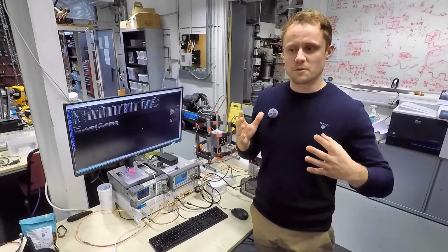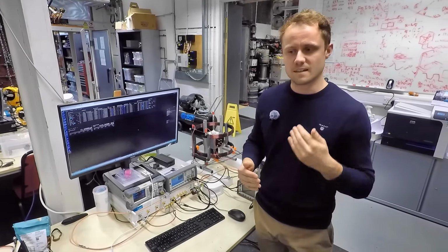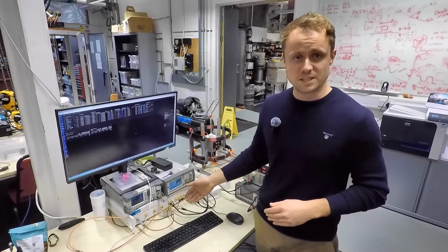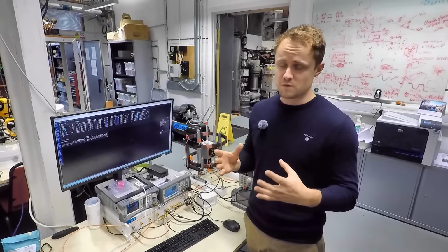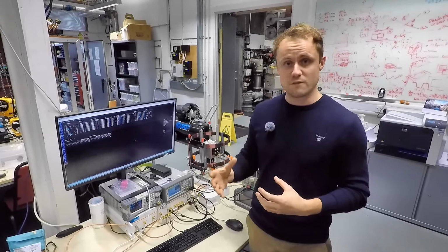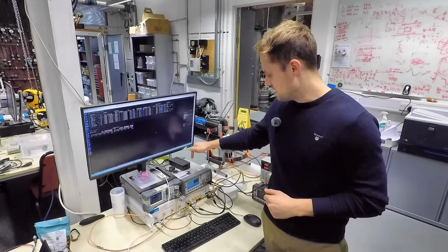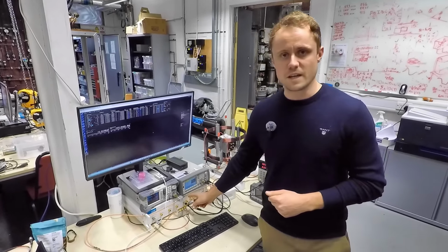And how do we detect that? Well, we use what's called a lock-in amplifier. So lock-in amplifiers are pieces of equipment designed for measuring signals at specific frequencies. So this is the lock-in amplifier I've got in my kit. I'm using a Zurich Instruments UHF. And the way that they work is that ultimately they are, to a first approximation, also mixers. So they will multiply your measurement signal with your reference. So on this one, the measurement signal is coming out of the mixer, and the reference is coming out of the waveform generator that's driving the modulation, which is then input into the lock-in here.